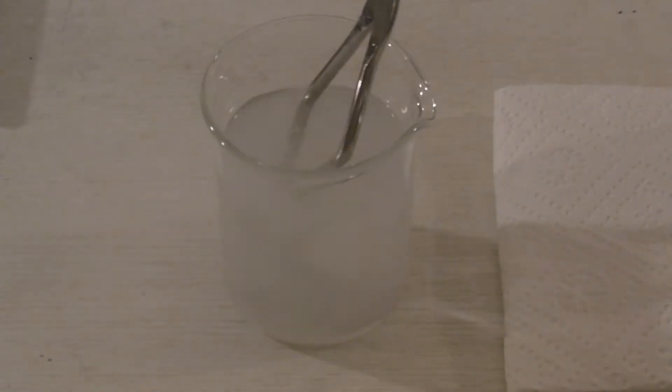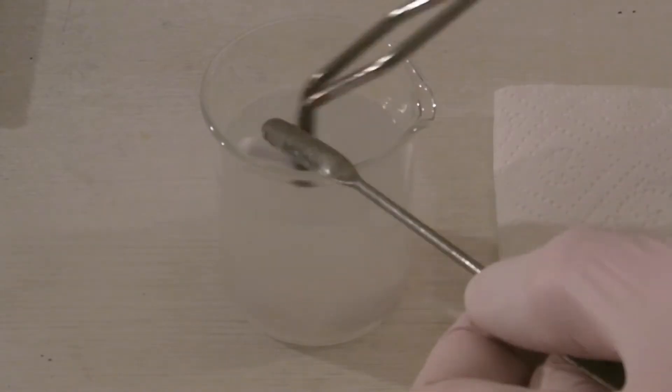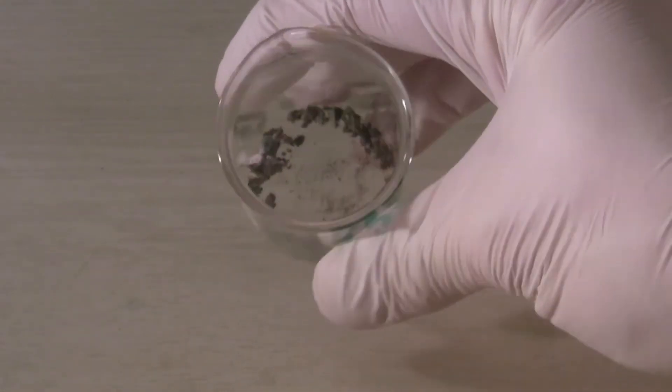I had collected a small amount of silver halide salts, which is why I decided to recover the silver. There are several ways; this one only applies to silver chloride and bromide. It was stored for some time and not kept away from light, so a thin layer of silver had formed on its surface.